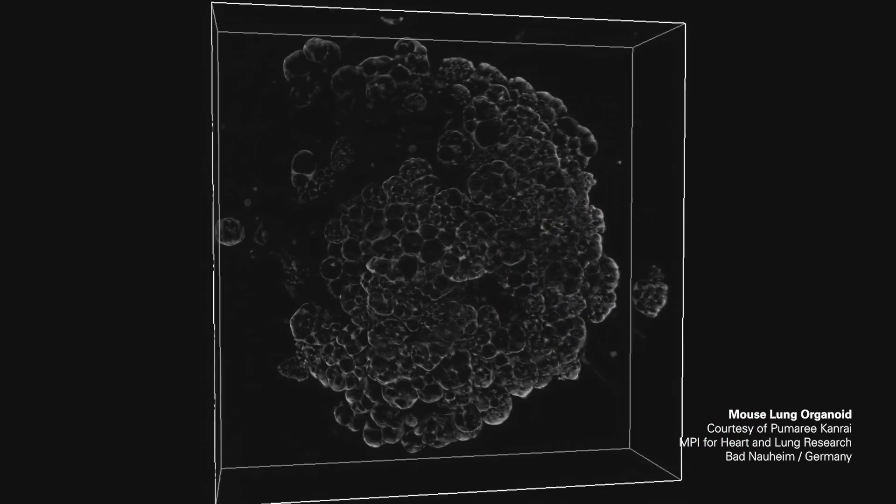If you think about technologies which are around, such as IPS cells or CRISPR-Cas, it's easy to see how 3D cell culture and those technologies come together in an amazing way, and it allows us to create those powerful disease models that you can use to target diseases such as cancer, diabetes, Alzheimer's, and Parkinson's disease.